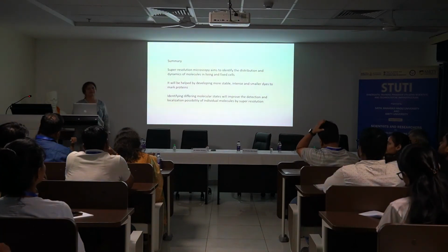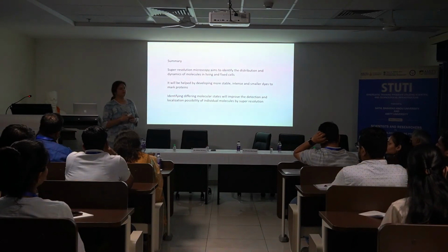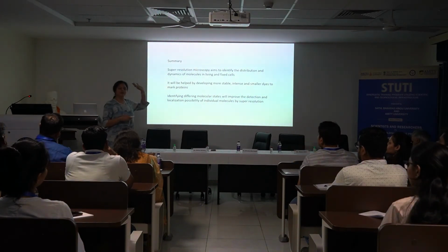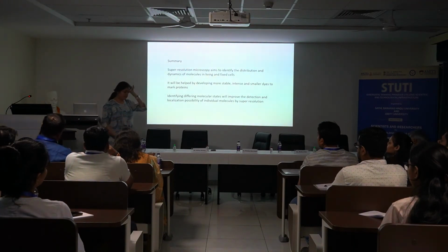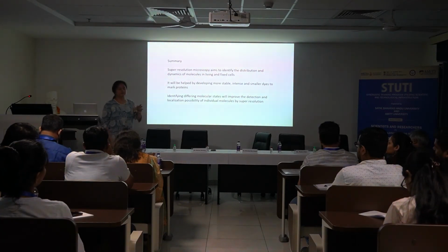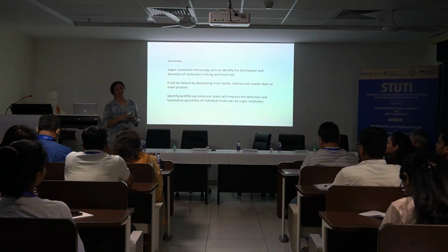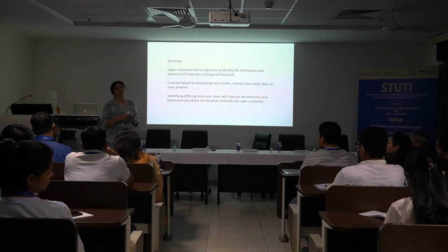Yes. As I know, we have to fix the cells or fix the particular... No, you can use live cells. I will recommend you to see Stefan Hell's Nobel lecture, the 2014 lecture, which is still old, I would say, in terms of development of this method. What he has done is he has looked at the remodeling of synapses in a live mouse brain, and you can see the remodeling of those synapses in a live mouse brain really well.